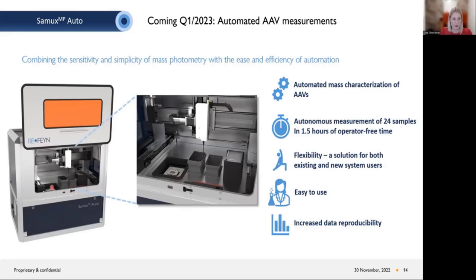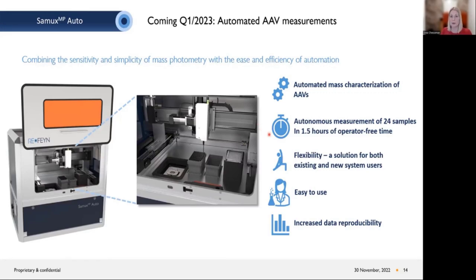The SAMXMP Auto: the SAMXMP mass photometer sits in the bottom drawer, permanently mounted. In the workspace, a door closes for a laser-safe system. The objective is here, the measurement area where you drop your sample, a fresh pipette tip waste area, and a 96-well plate where you supply both buffer and samples. The robot pipette operates automatically. The system measures up to 24 samples in about one and a half hours — one slide holds 24 samples. After 24 samples, you remove the slide manually, place a new one, and run another 24. The automation can also be retrofitted onto any existing SAMXMP already in the field.